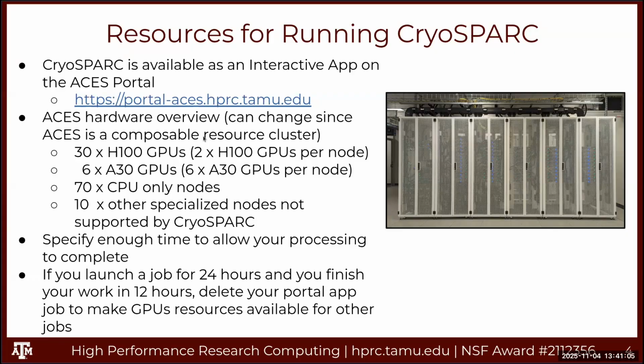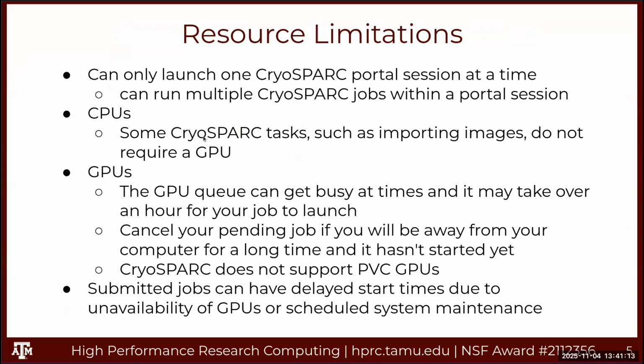And if you launch a job for 24 hours and you're done in less time than that, delete the portal job, and that way you can free up the GPU resources for other users. And we'll show you how to do that. Okay, so as I mentioned earlier, you can only launch one CryoSPARC portal session at a time. But within the CryoSPARC session, you will be able to launch multiple jobs.